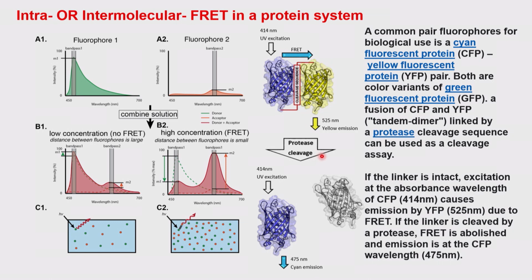Now, how do I know that is really FRET? Now, I just break the link here. So, what is this link? The link is a peptide link. So, therefore, this peptide link can be broken by the peptidase enzyme. So, use a specific peptidase enzyme, and then break this one.